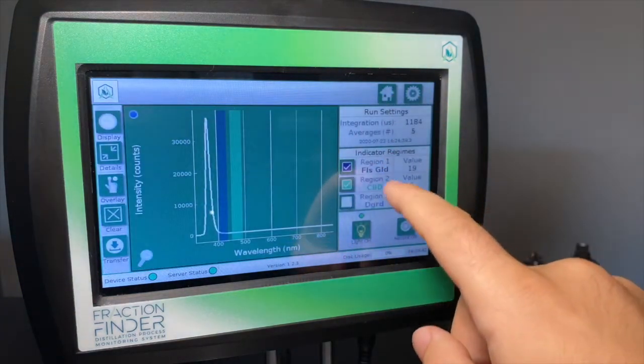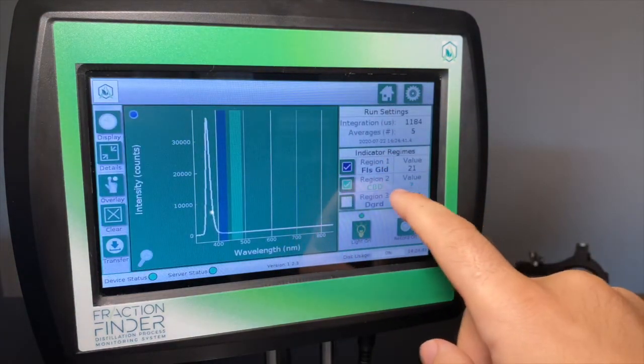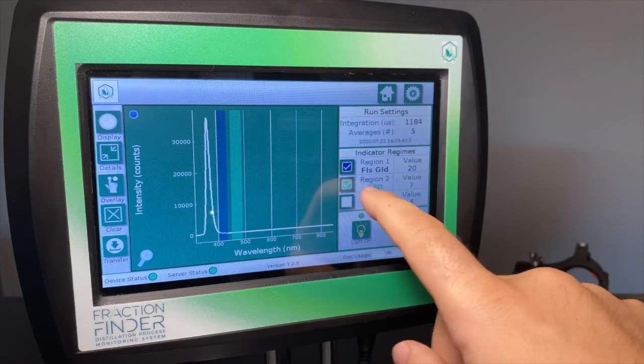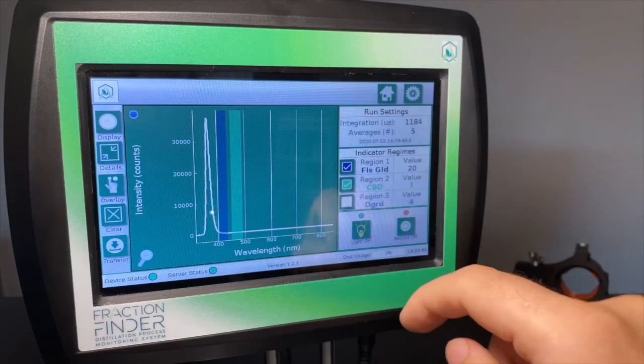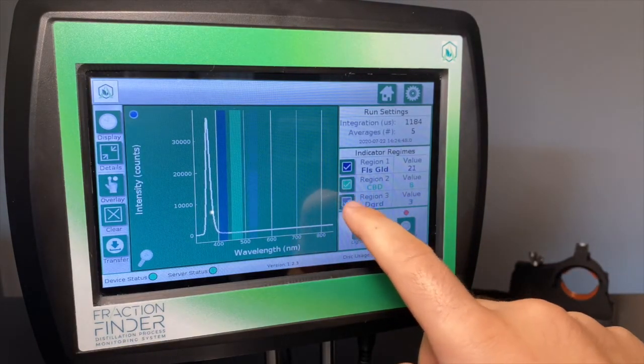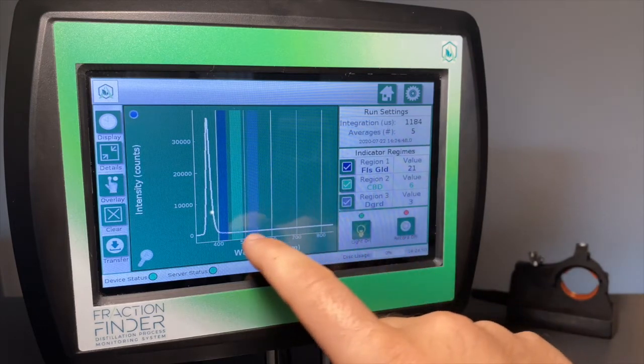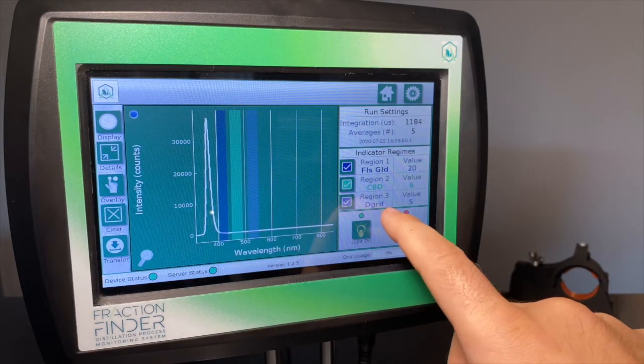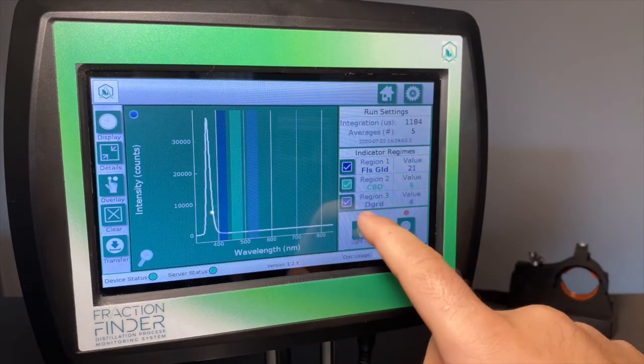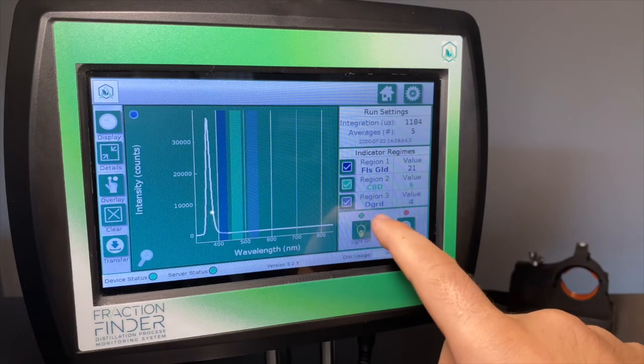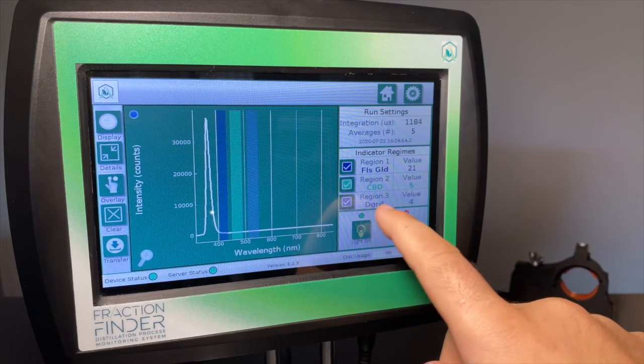So now we changed our mains to represent CBD and then you should set region 3 to track degradates. So degradates essentially represents the start and middle of your tails fraction.